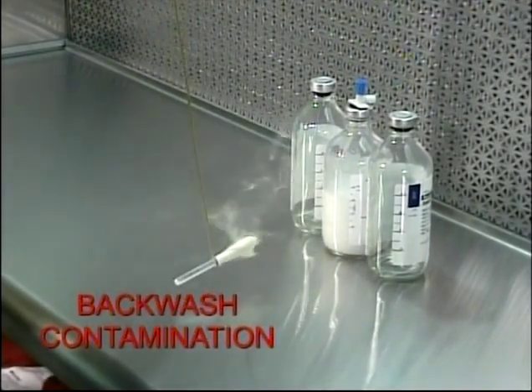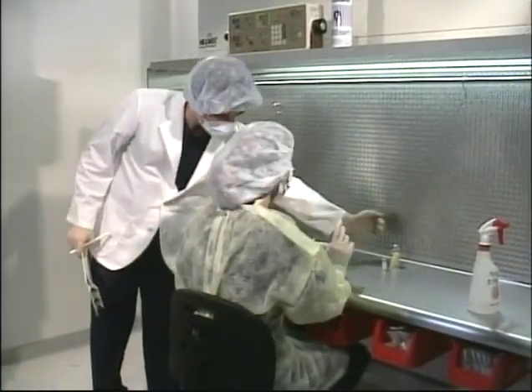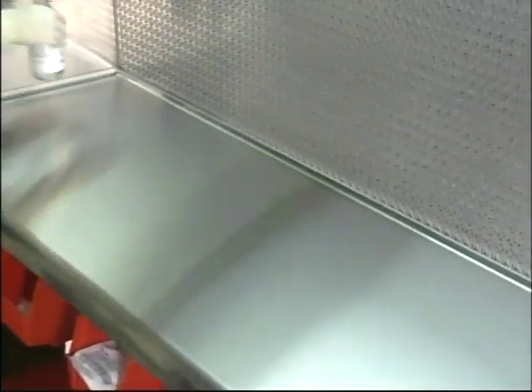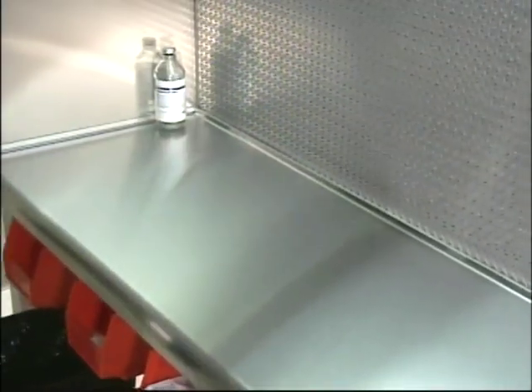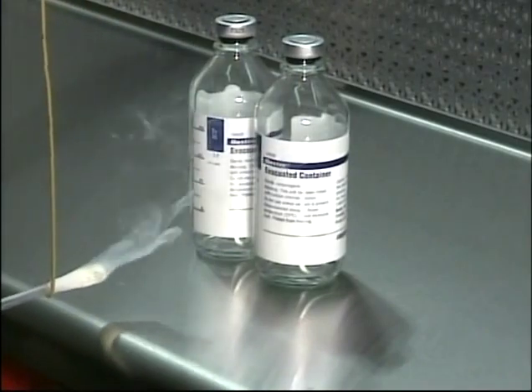Several conditions may cause backwash contamination, such as room ventilation or air conditioners which produce air currents counter to the flow of air from the LFCB, movements of personnel in close proximity to the LFCB, the arms of the operator extending into the LFCB, and objects placed too near the open end of the LFCB.